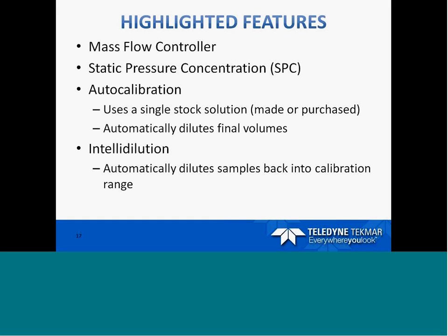A couple features that I'd like to point out are the mass flow controller and static pressure concentration, which is a little bit different than for those of you that had the previous Phoenix, where we used a flow-through detection scheme. We're going to talk a little bit about auto-calibration and IntelliDilution.